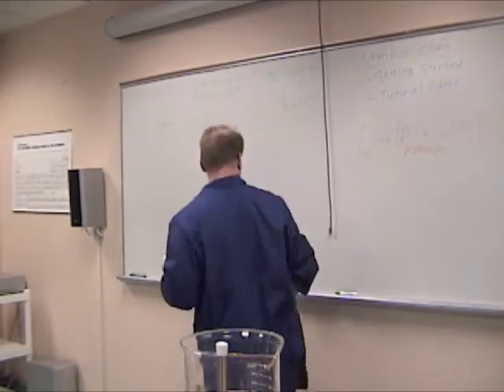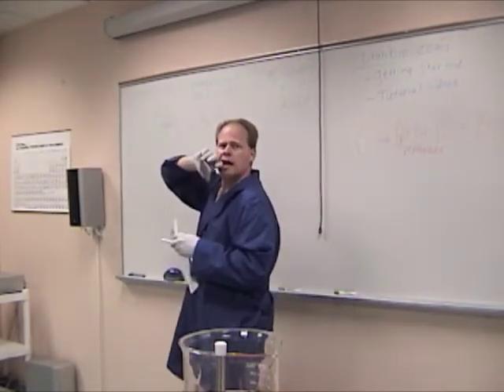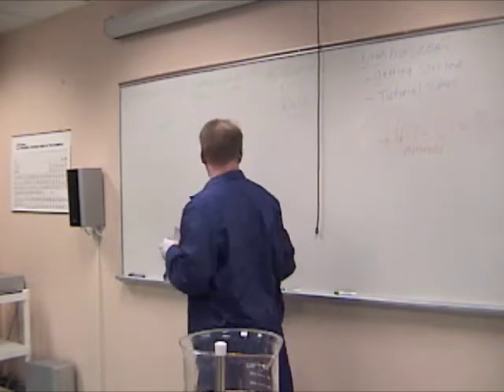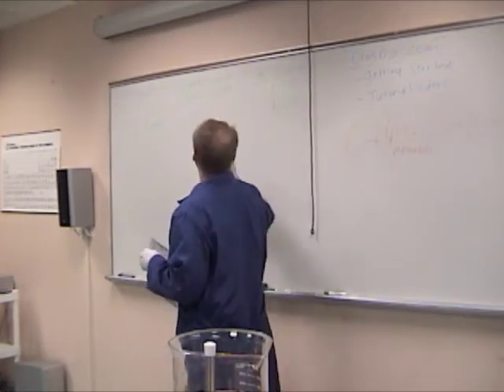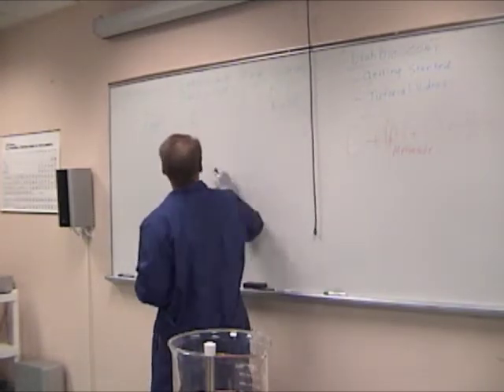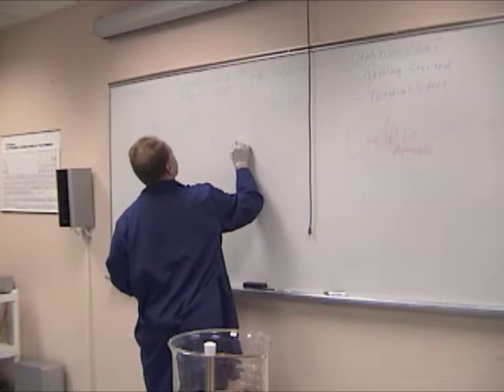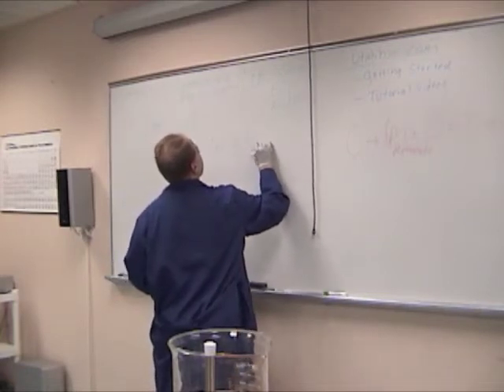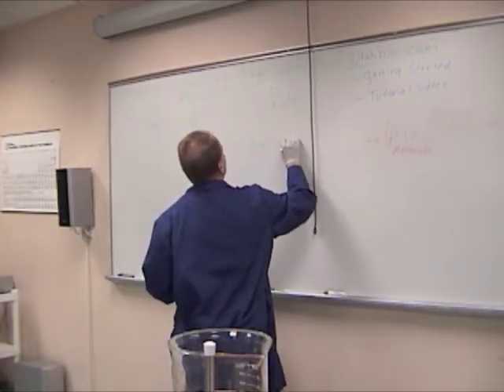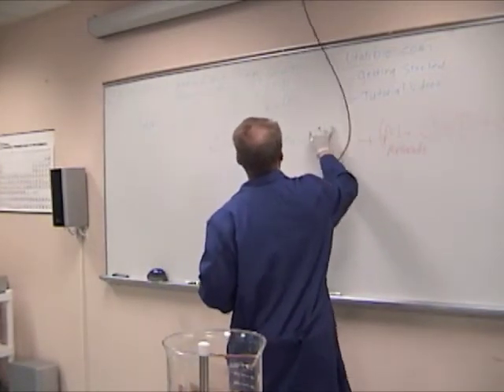0.1%? No, so 0.01. 1 gram to 1 liter, 1 to 1,000. That's 0.01. I never get it right, but I just know how to make it. To make it, you take 1 gram of your catalyst plus 1 liter of water, which equals your titration solution. Okay?